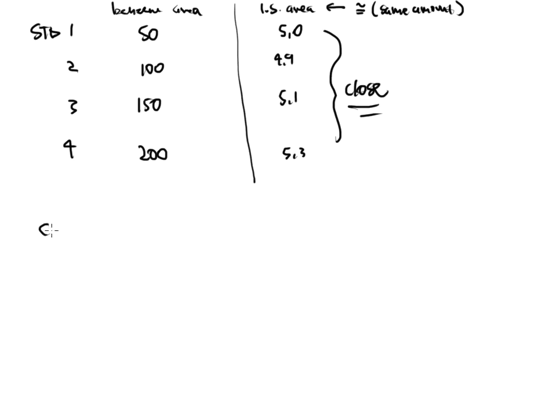But if someone asked you to plot a calibration curve using the internal standard, you just simply don't do standard 1, 2, 3, 4. Let's say that these are part per million. 1 part per million, 2, 3, 4 part per million, and plot the benzene area on the curve, right? Why would you go through injecting the internal standard if that was the case? That's a normal calibration curve. That's how we started out the semester, right? But now this is a better method.